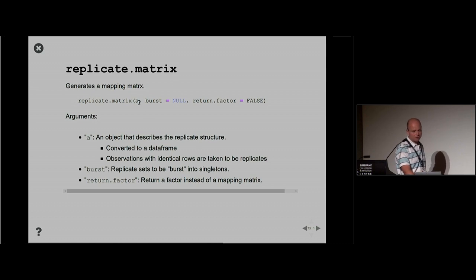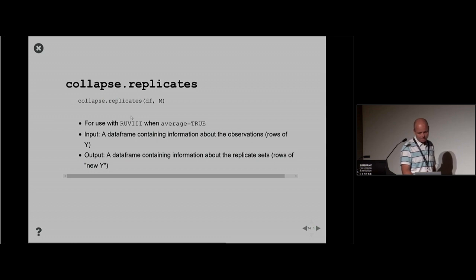So as another example, say that I passed in a data frame that had 2 factors, and let's say that the 2 factors are brain region and patient. Then any 2 observations that are marked the same in terms of the brain region and the patient will be treated as replicates. Okay, so that's the way that this function works.